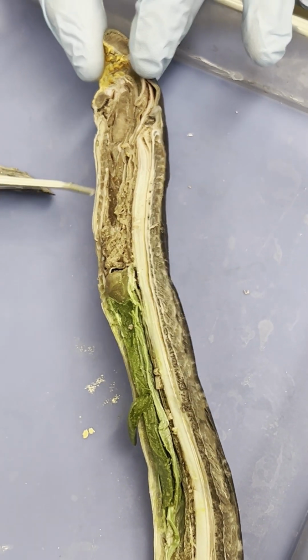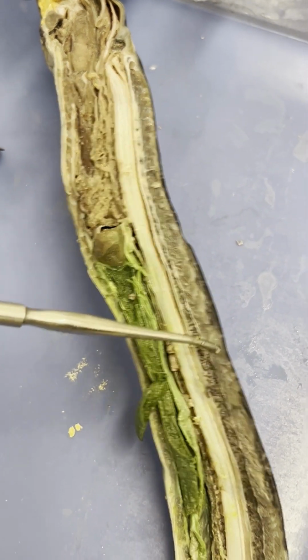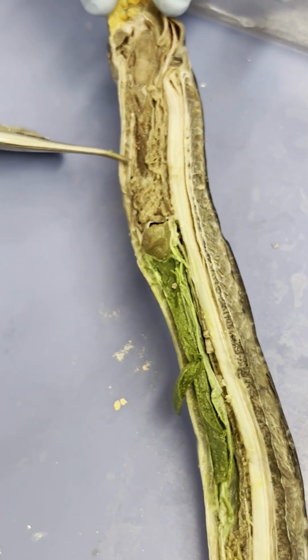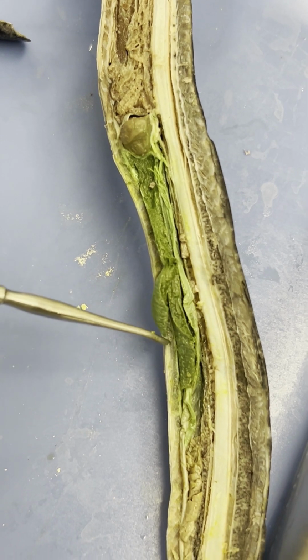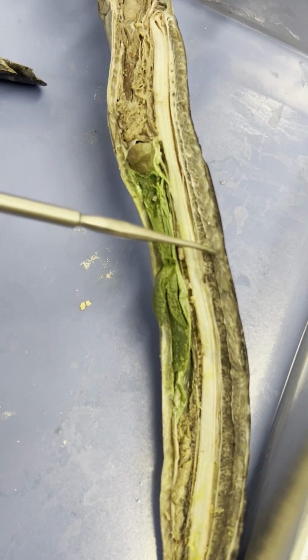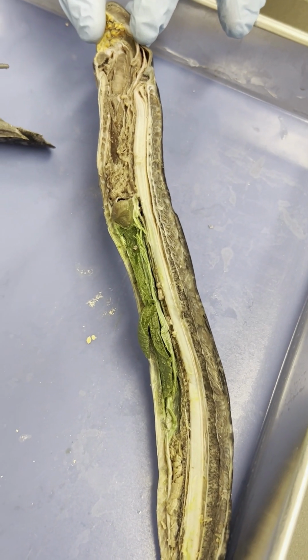Okay? We also have myomeres. So we have dorsal myomeres here. Myomeres is a fancy way of saying muscle. And here we have our ventral myomeres, our ventral muscles of the animal, helping this fish mostly swim through water, looking for prey, looking to mate, different things that animals do.